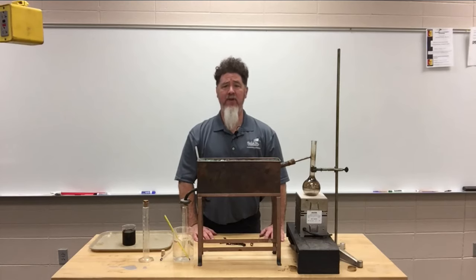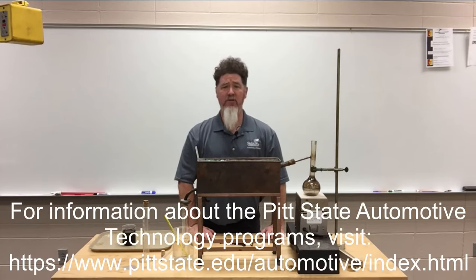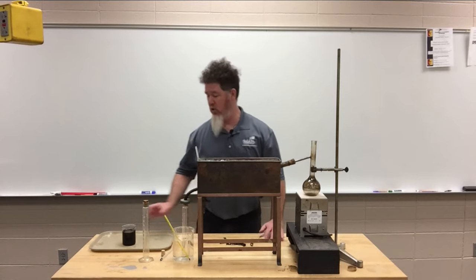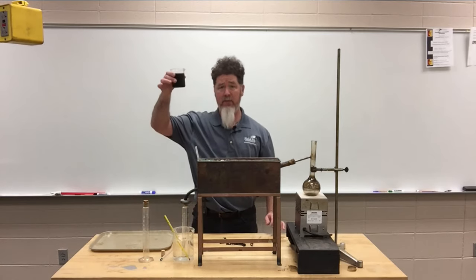Hi, this is Professor Scott Norman from Pittsburg State University, and we are in the Department of Automotive Technology in our fuels lab. And part of this class that we do, this mobile fuels class, is we have our students do an activity where they distill crude oil to make gasoline, straight run gasoline, and some diesel fuel. So they'll separate the actual crude oil into some simple fractions.